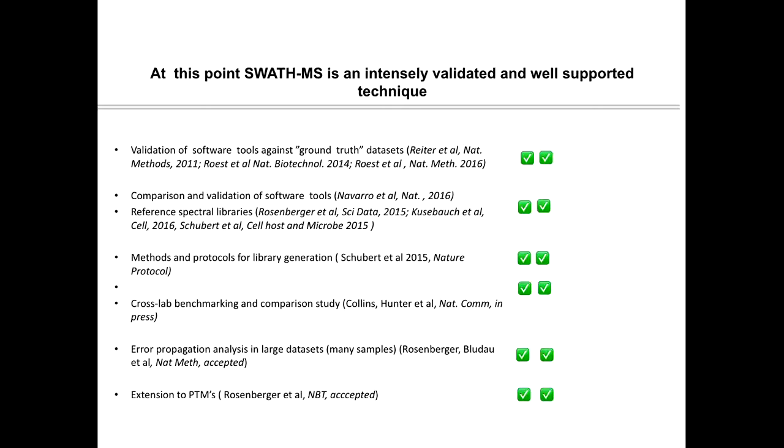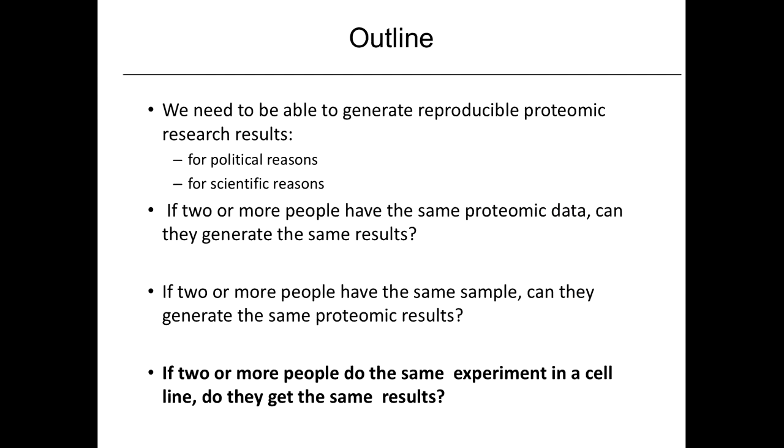And so all these steps have been published, and that's why I think it is a well-supported technique which is relatively straightforward to implement in the laboratory and has the very high potential to generate reproducible research results within the limits that it can do, the limits of detection, limits of quantification. But within these limits, I think it is currently the most strongly benchmarked proteomic technique.